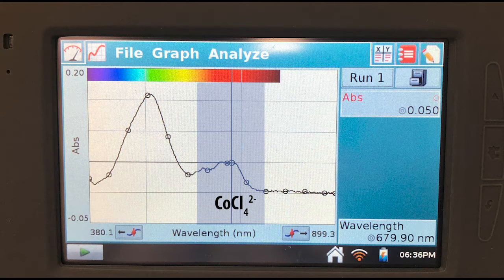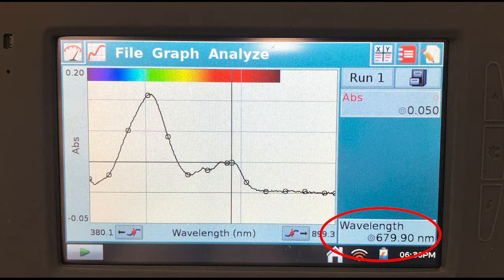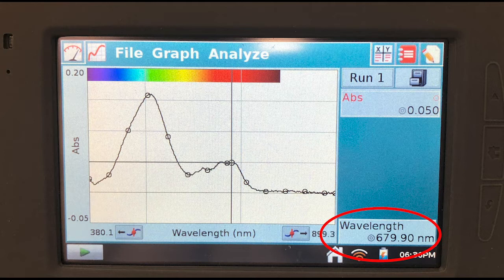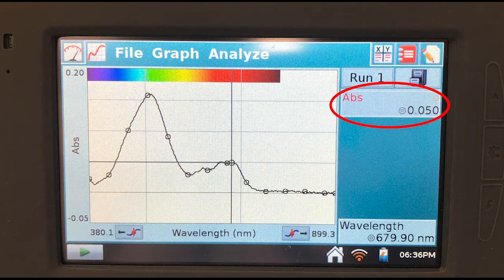We're just going to focus on this peak that's on the right, which is due to our product. The lambda max of this peak, the wavelength where it absorbs the most light, is 679.90 nanometers. This is the wavelength where we're going to be collecting the absorbance of all of our samples. Notice that the absorbance of the room temperature sample is 0.050.